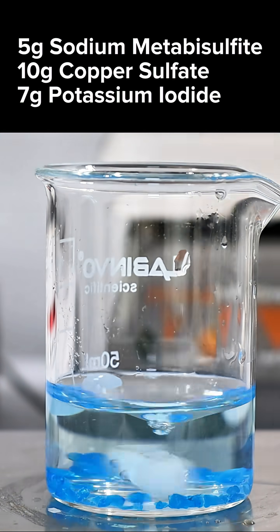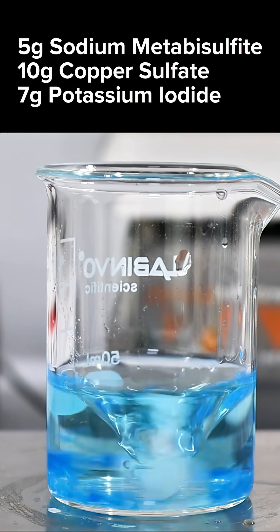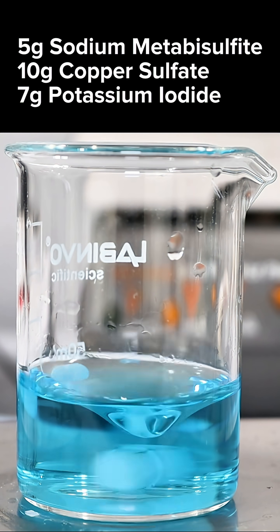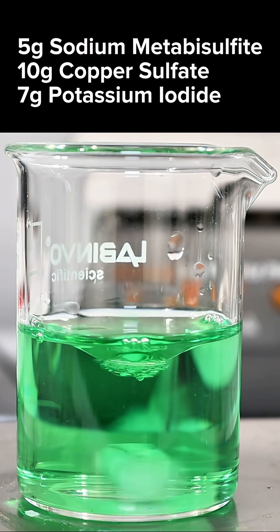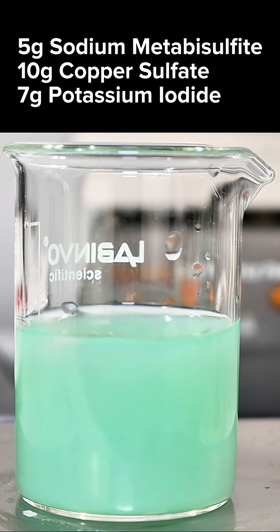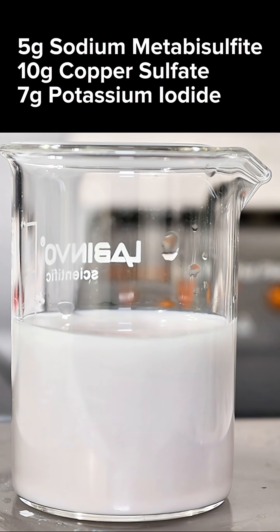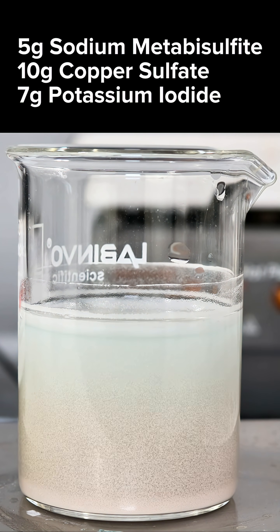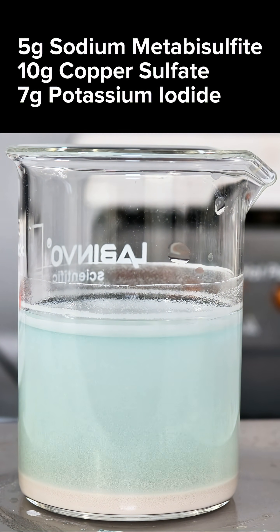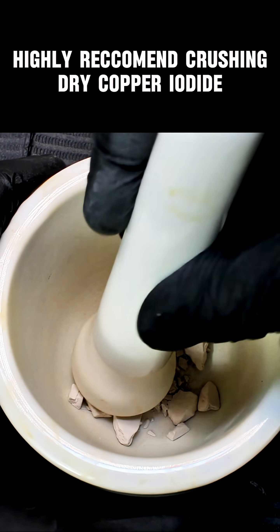To do this, dissolve a little bit of copper sulfate in water and then add sodium metabisulfite. This will turn green as the copper ions are reduced, and at this point add some potassium iodide. Copper iodide is insoluble in water, so filter it off, dry it out, and crush it into a powder.